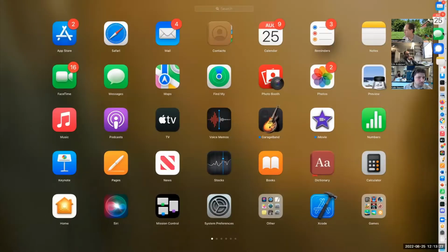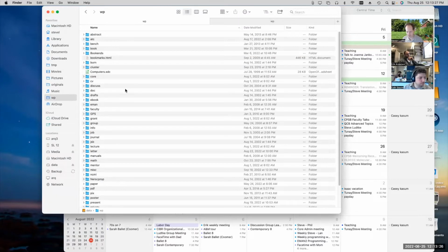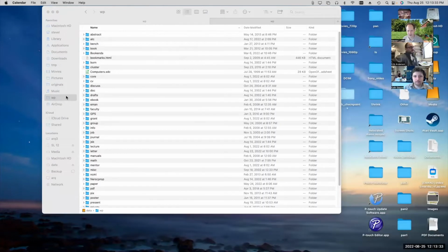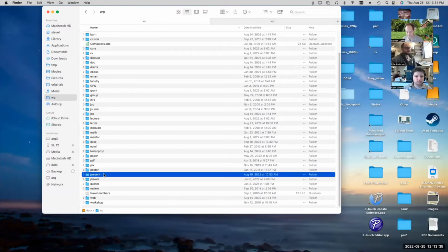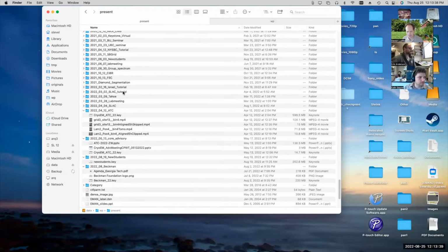Let me see if I can find an old presentation somewhere we can take a quick look at. Does that partly have to do with the ice variable? Well, there's more we're going to talk about. Don't worry. But I'm going to start with this.